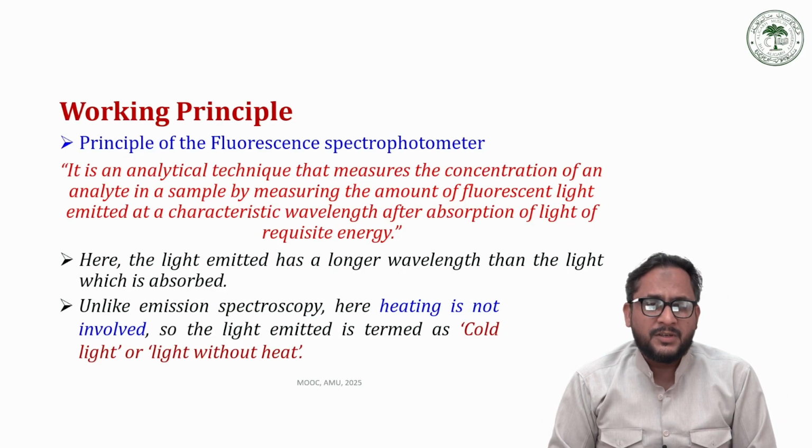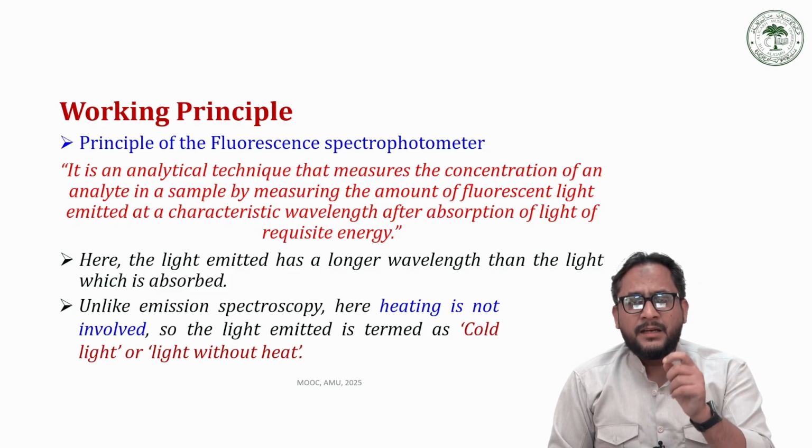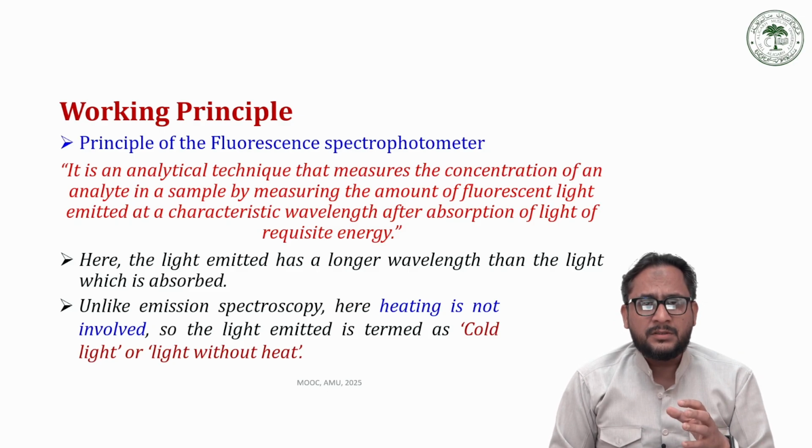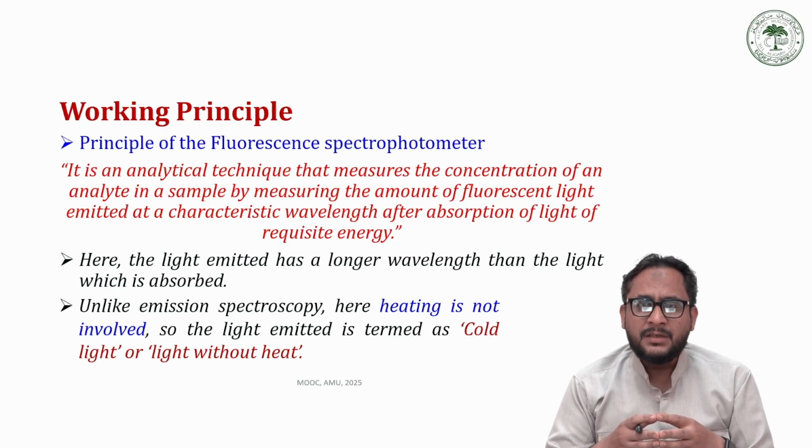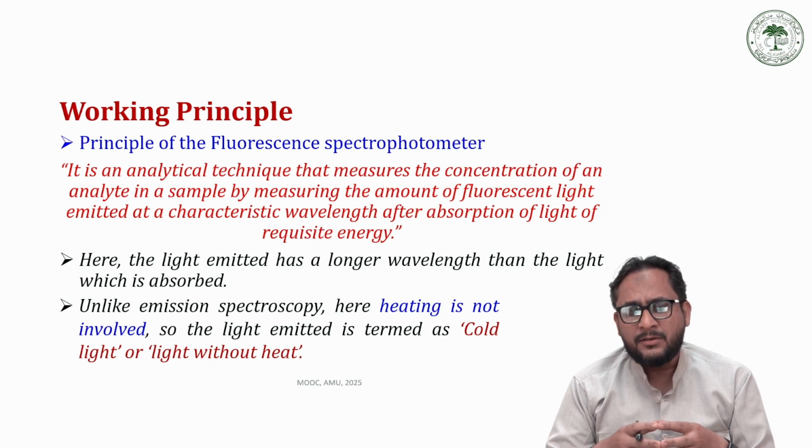So the working principle of fluorescence spectroscopy: it is an analytical technique that measures the concentration of an analyte in a sample by measuring the amount of light being emitted at a characteristic wavelength upon absorption of light of requisite energy.